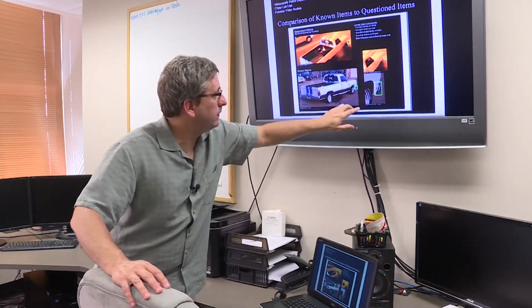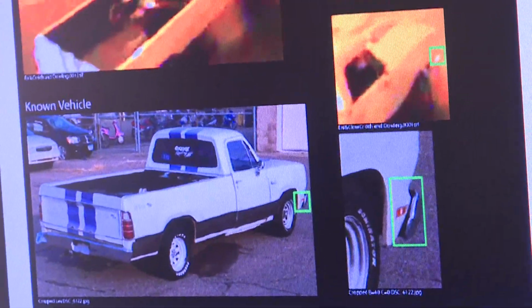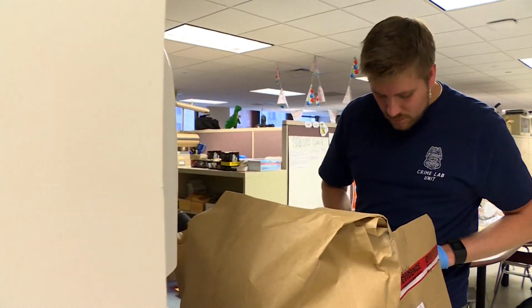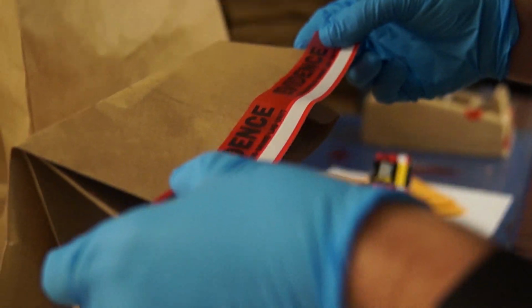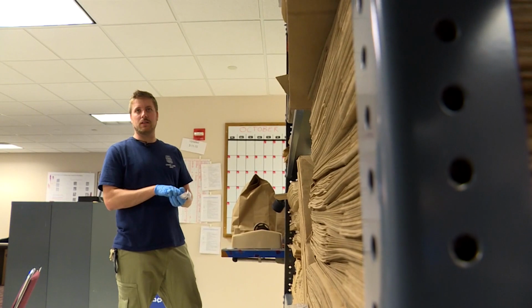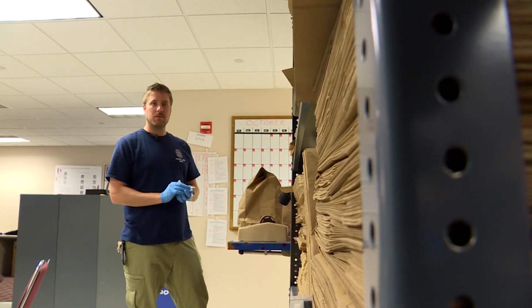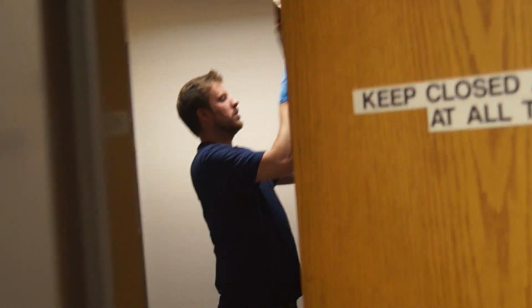So in this example, you know, this is the known vehicle, this is the unknown vehicle. You're looking for things that are consistent or inconsistent. They all have gone to school in some way, forensics, science, what have you, and then we put them through quite an extensive on-the-job training as well. Typically, if we can help it, the person who collects will be the one who processes and packages as well. The least amount of changing hands or people handling it, the better. By the time they hit the streets working independently, they really have a solid base in what they're doing, and just a really talented group of individuals.